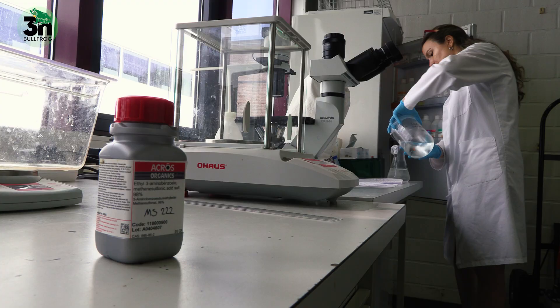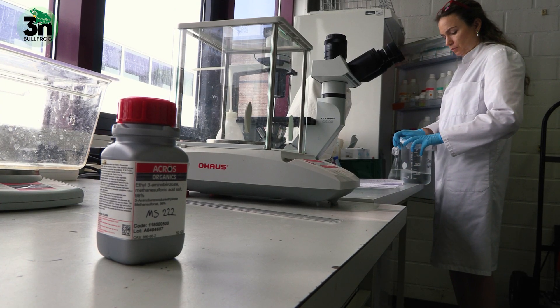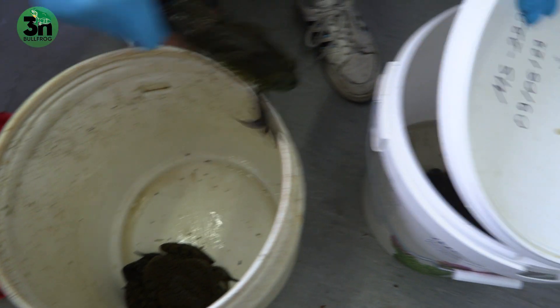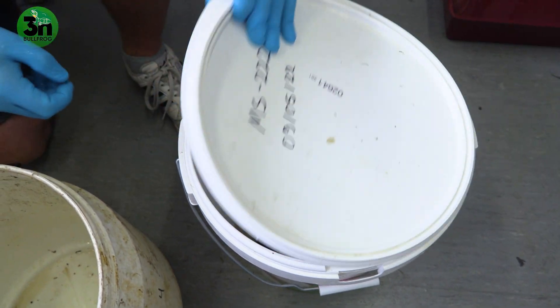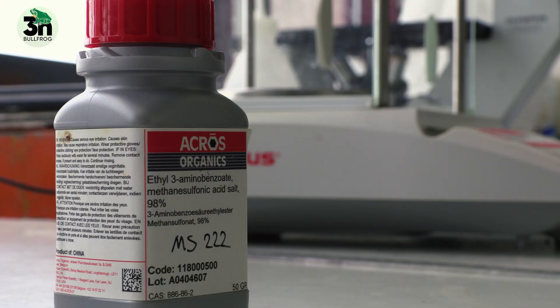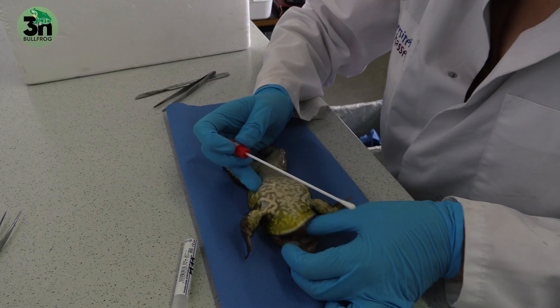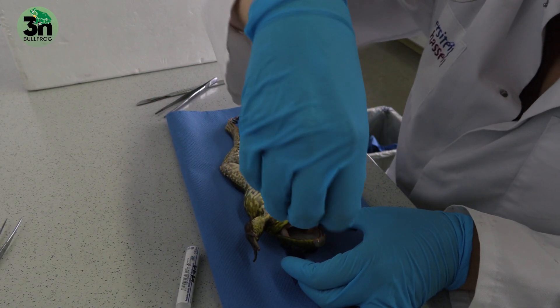Two hours after the induction of spermiation with the males, we euthanize the males with MS-222 and then we retrieve the testes out of the individuals. The swabbing of the adult individuals takes place to determine their genetic profile, which makes it easier to determine the ploidy level of the larvae from which they are bred.